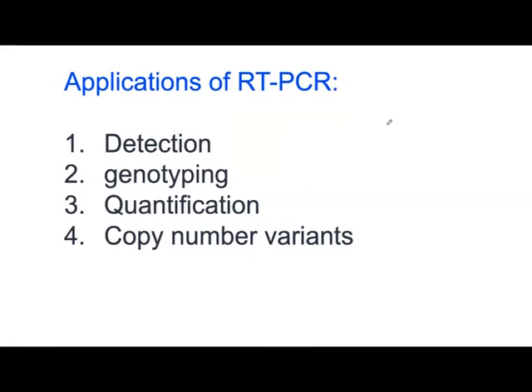Now, as I said, this is an introductory webinar where I talk about detection and different analysis, but it will be followed by two analysis workshops. We are not going to discuss analysis in detail today. One of the workshops is on how to design primers and multiplexing for different applications like genotyping and detection. In the second workshop, I'm going to spend good time on how you quantify.